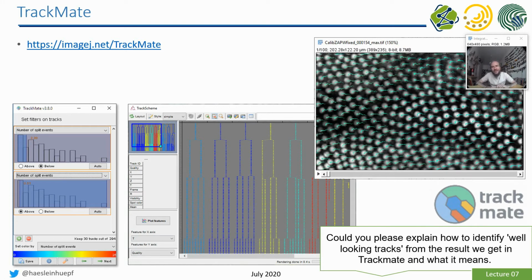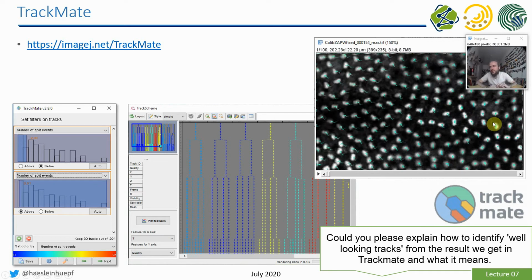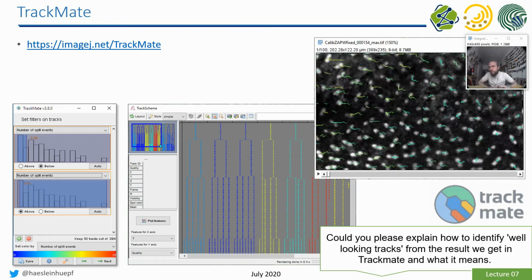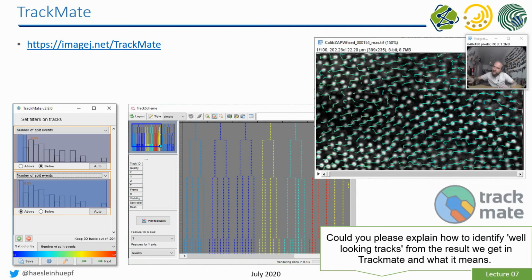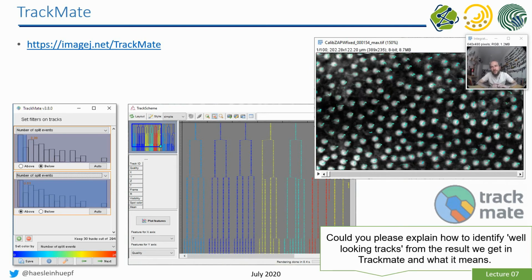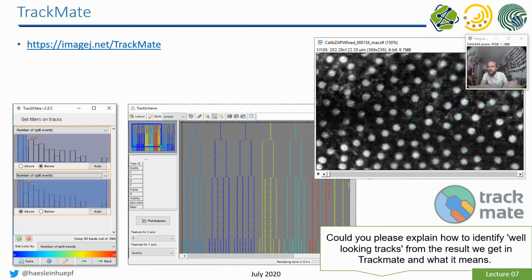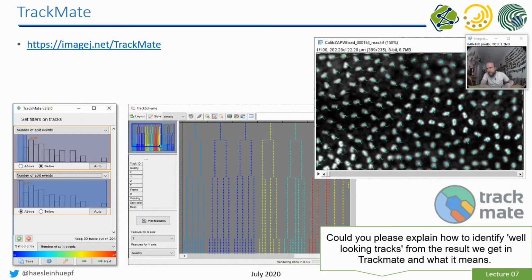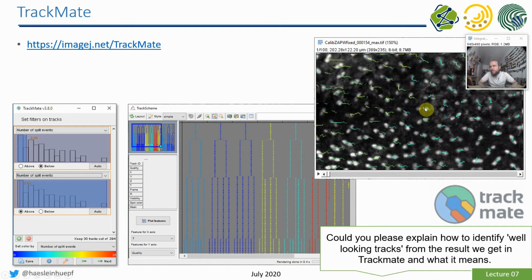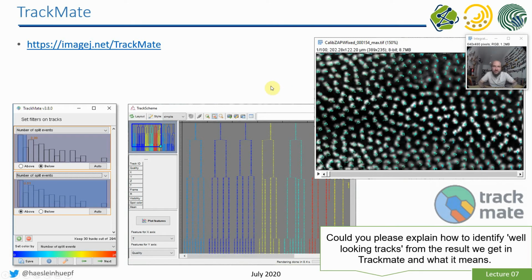And I think, honestly, it's not necessary to get all these hundreds of cells tracked perfectly in order to do a quantitative measurement. If you have something like 10 or 20 good looking tracks, and you can exclude all the other ones where maybe the detection didn't work, then you can start concluding from this measurement. So you don't have to track every cell perfectly. A small amount of cells is enough in order to continue research and to draw conclusions. The track scheme has to represent what you observed in the video. And of course, ideally, you can apply the same strategy to several data sets.